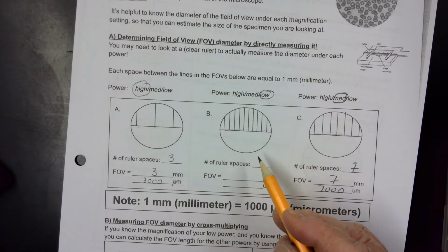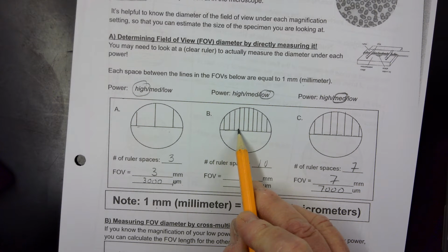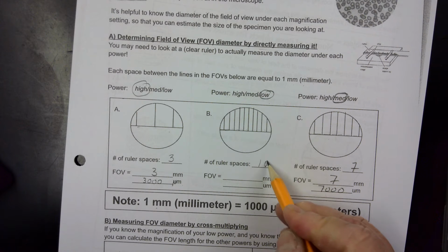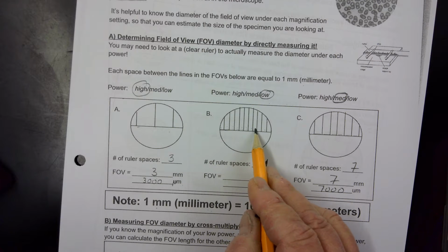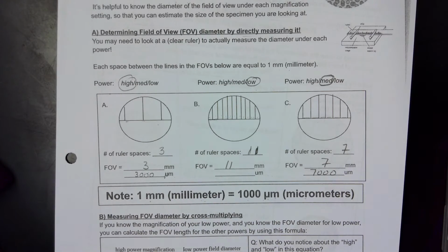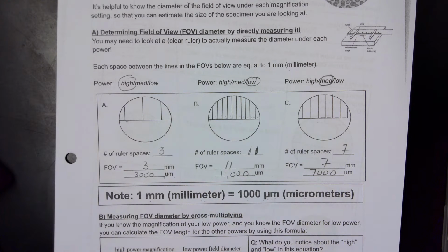I feel like I'm counting that wrong. Yeah, maybe this is a full one right here. So I think this is actually 11 total ruler spaces: 1, 2, 3, 4, 5, 6, 7, 8, 9, 10, 11. So we are looking at a field of view of 11 millimeters, and of course, that means that we have 11,000 micrometers.